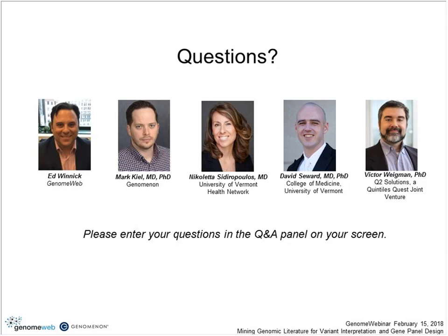Thank you, Ed. That's a great question. I apologize for neglecting to mention that during my portion, but Mastermind is updated on a weekly basis for both all titles and abstracts that have been published in that interval week, as well as any of those titles and abstracts at the full text level that contain genetic or genomic content. So the short answer there is every week.